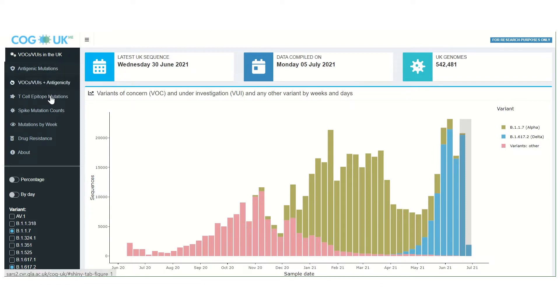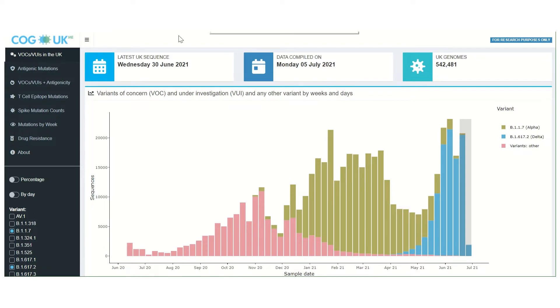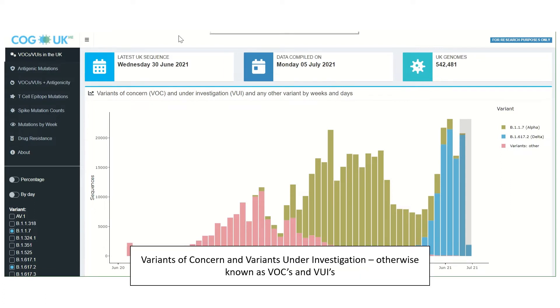The tabs on the left hand side allow for navigation between information on mutations that are significant for various different reasons. The landing page is the tab for variants of concern and variants under investigation, otherwise known as VOC and VUI.